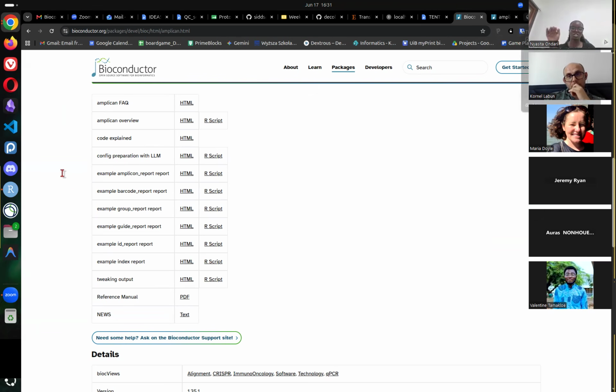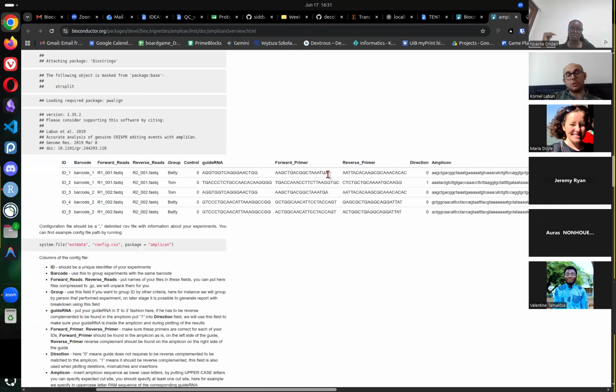Do you create each line, each event, with a separate guide here, and a separate group? These are two separate guides, yes? But is this a new case or not? Come again? Is it a new experiment or not?